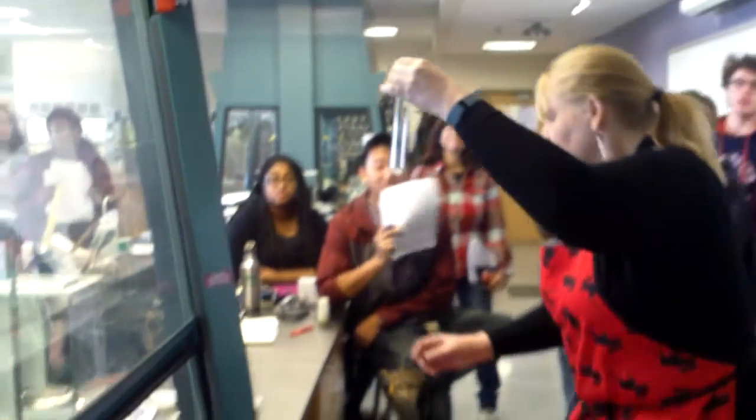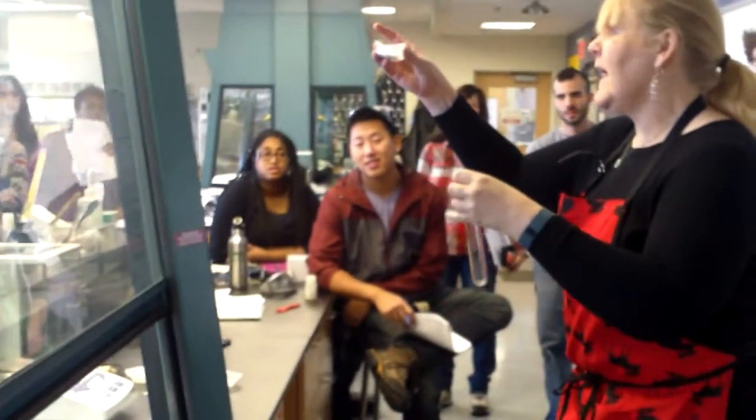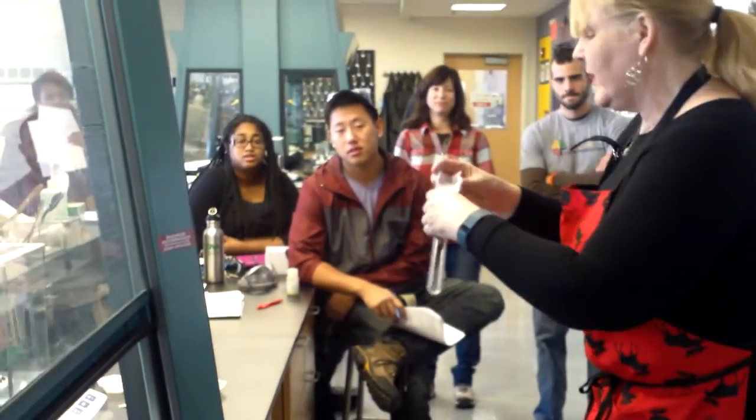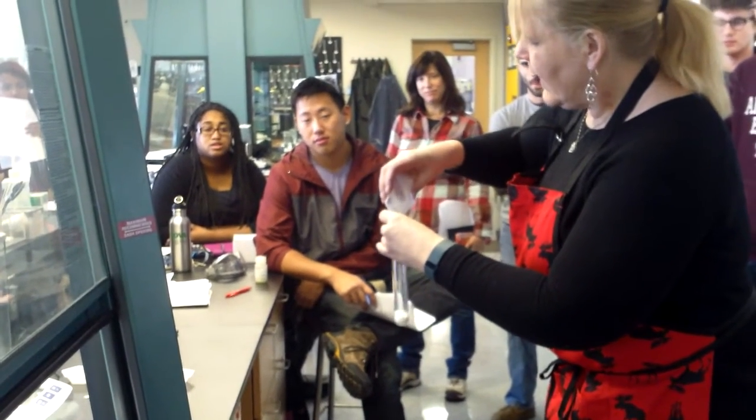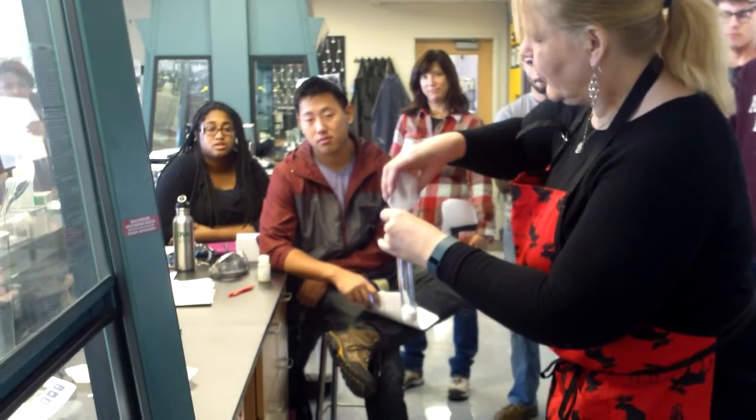You're going to take a nice fat test tube. You're going to take your carefully weighed naphthalene sample and you're going to put it into the test tube. And we're going to start out with our naphthalene as we do our freezing point depression.